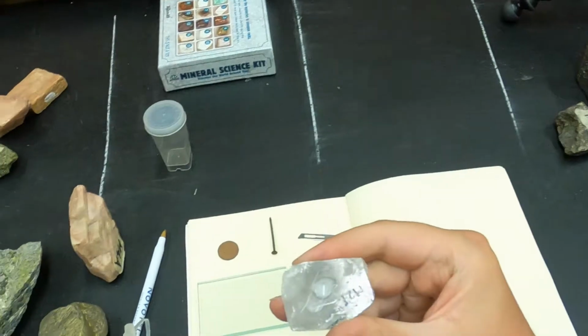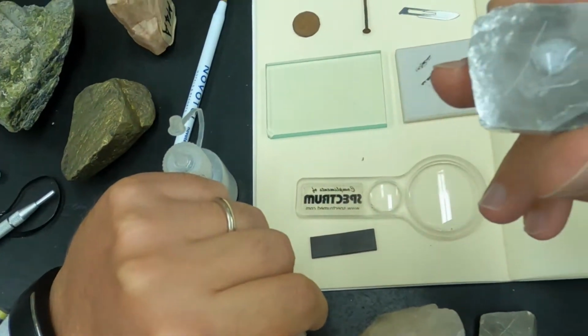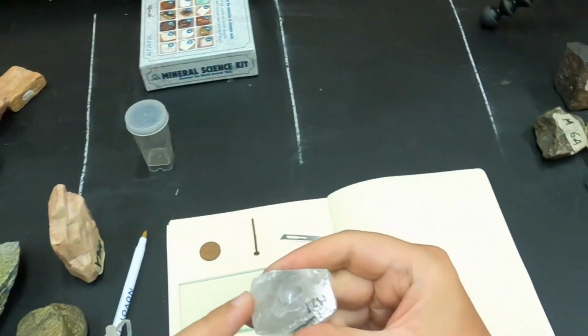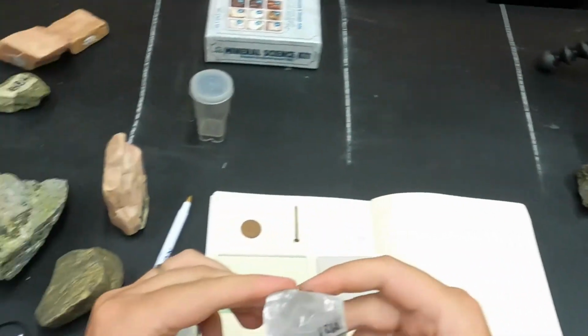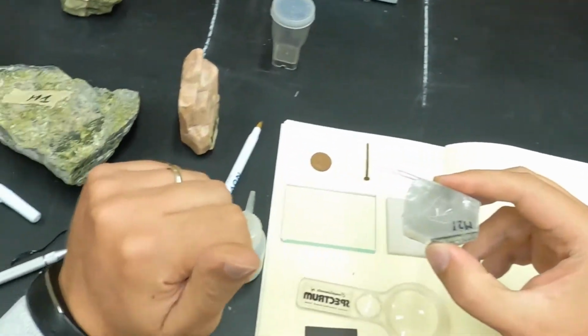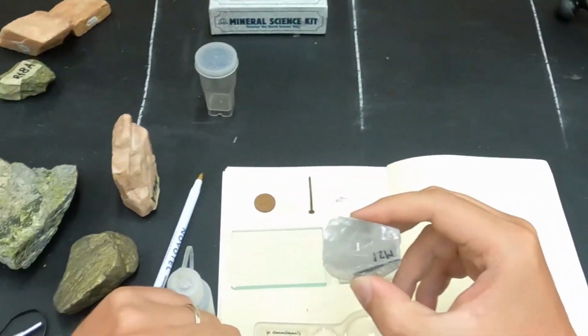Maybe the camera will be able to capture the fizzing. Really vivid fizzing with a drop of this acid tells you that this is a calcium carbonate. So that's a diagnostic criterion for the identification of carbonate.